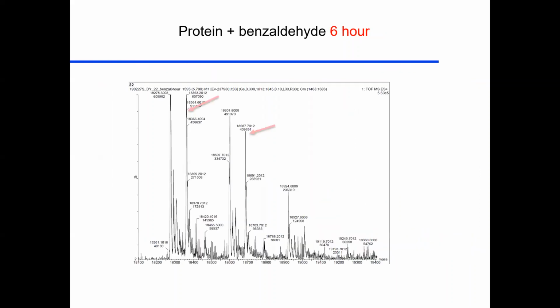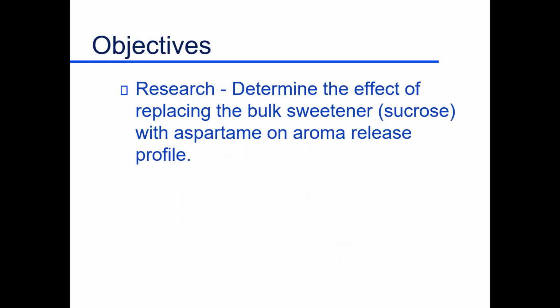This is 6 hours later. Now, this unreacted pure beta-lactoglobulin, almost 50% of the protein has had at least one benzaldehyde added on. And the same here. So your flavor is disappearing as it goes on. So it's a really nice way to look at protein flavor reactions.